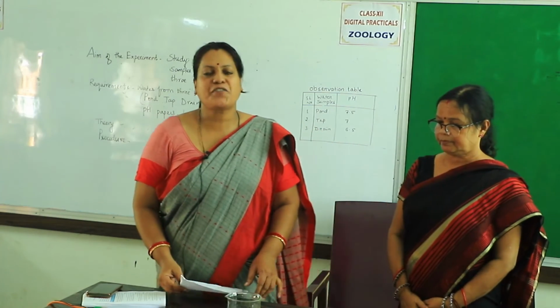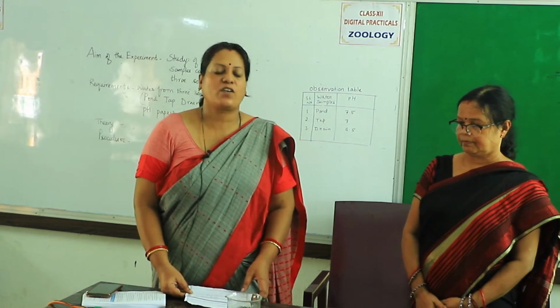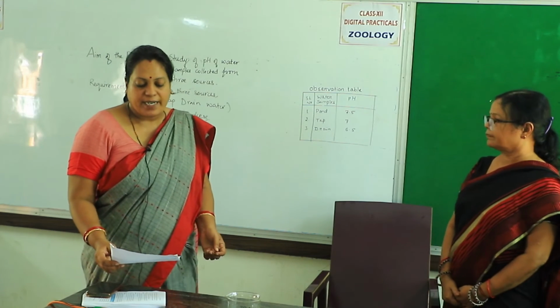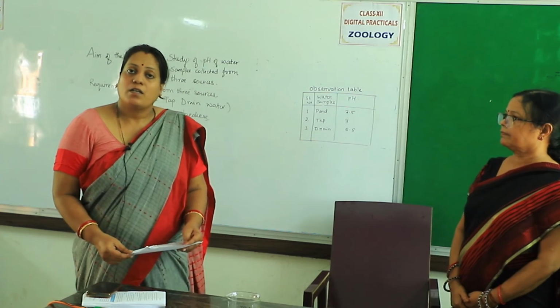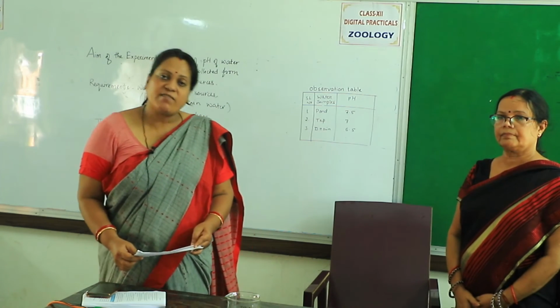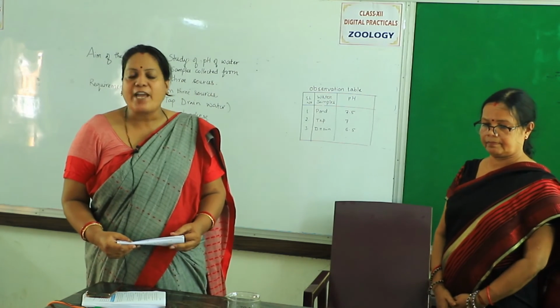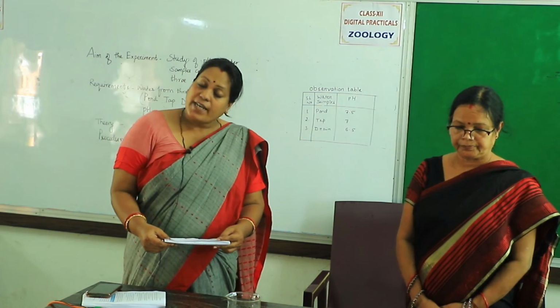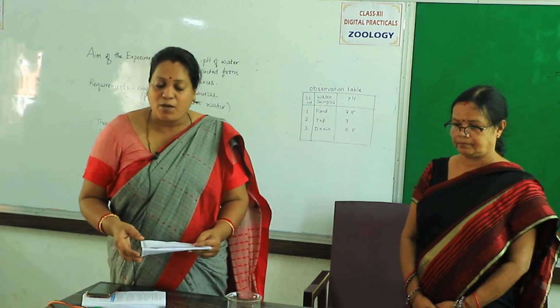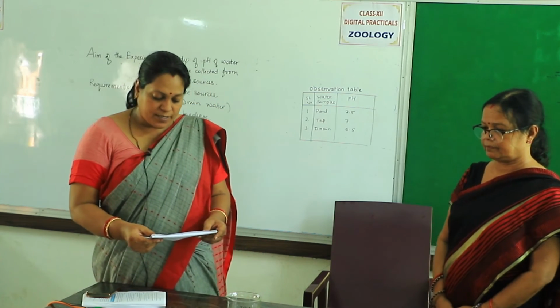Students, since ma'am demonstrated how to find out the pH of different water samples, we will fill up the observation table like this, and the conclusion is there in the observation table. There are certain precautions we write at the end of the experiment: taking clean and dry pH papers, then taking clean and dry test tubes if we are going to take the sample waters from the three beakers where the three types of water are.